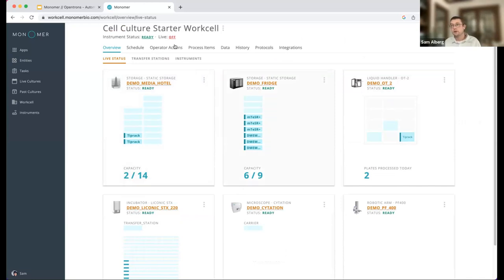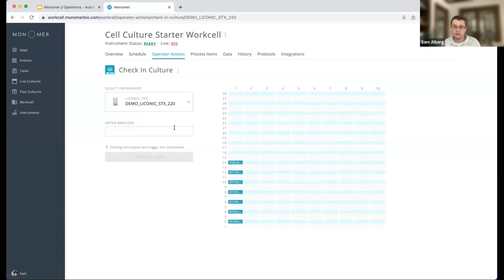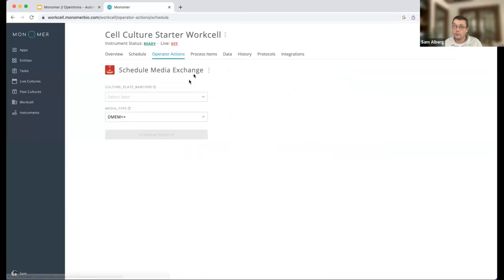If you're a scientist, you go into the operator actions, and this is how you interact with this work cell. These teal items below allow you to load new reagents on the work cell or check a new culture into the incubator. Very simple operations that let you update the deck and update the Monomer software so that it reflects the physical layout of the deck. In order to actually perform experiments, you'll use these red actions, which let you schedule different types of experiments that you've configured in Monomer. To start today, I'll just show a very simple media exchange.